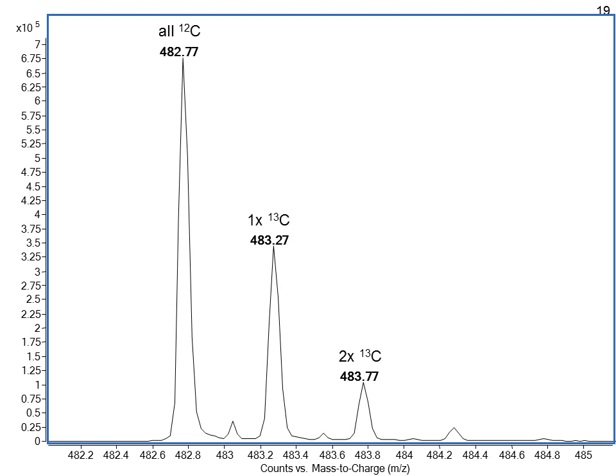So dependent on the resolution of your mass analyzer, because these isotopic peaks must be resolved, you can actually determine the charge state of a molecule. Modern acquisition software of mass spectrometers can do this automatically on the fly and use this information to calculate the molecular mass of an ion.